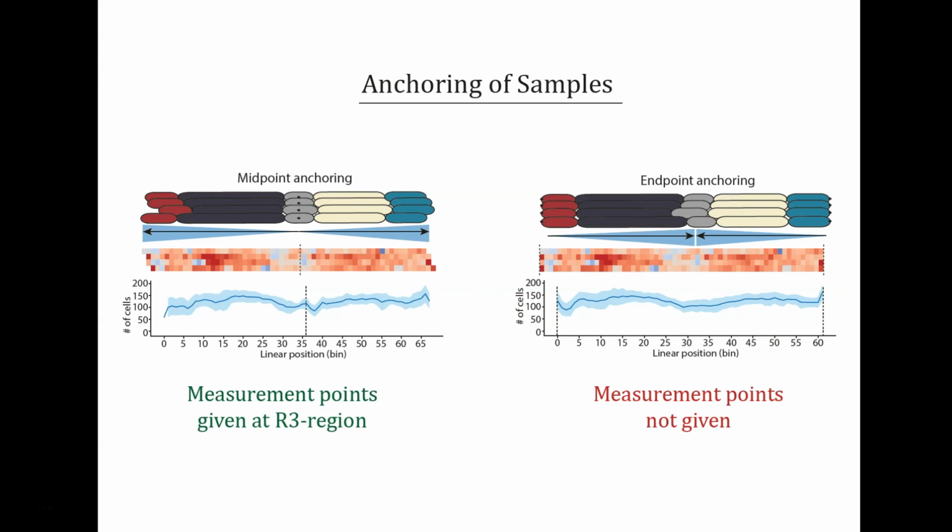Due to the variation in midgut length, the further you go from the anchoring point, the greater the error in cross-sample comparison. The user can also use the split and combine method to minimize this error. See the split and combine video for further explanation.